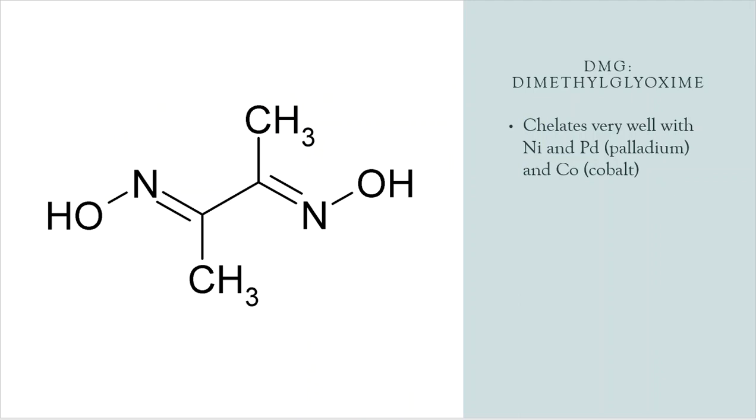So here's dimethylglyoxime, or dimethylglyoxime. Tomato, tomato. This is its structure. I want you to think of this structure as a hand with fingers. And the fingers are here and here. Those little fingers reach out and they grab the nickel. And they form a compound.